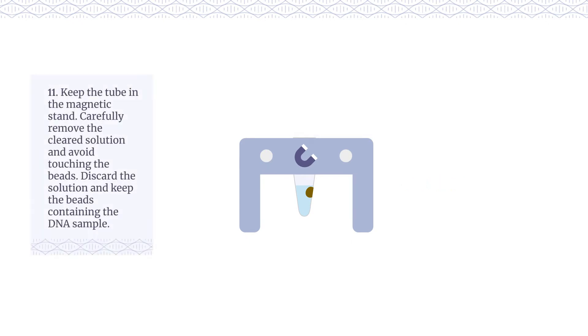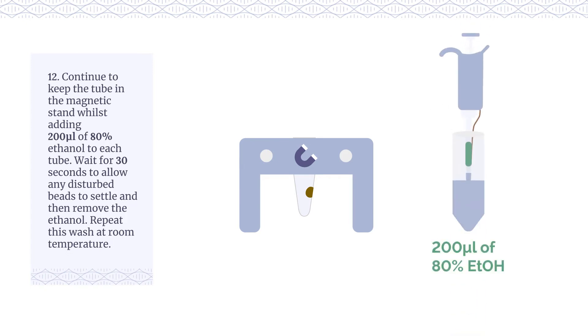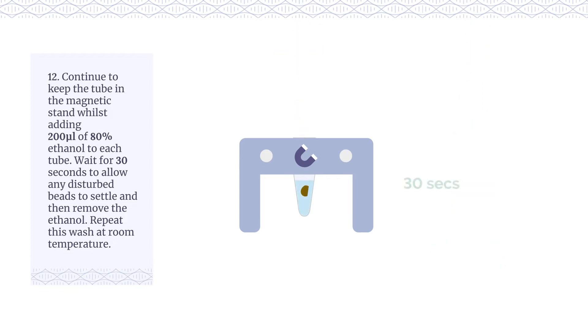Keep the tube in the magnetic stand. Carefully remove the cleared solution and avoid touching the beads. Discard the solution and keep the beads containing the DNA sample. Continue to keep the tube in the magnetic stand whilst adding 200μL of 80% ethanol to each tube. Wait for 30 seconds to allow any disturbed beads to settle and then remove the ethanol.